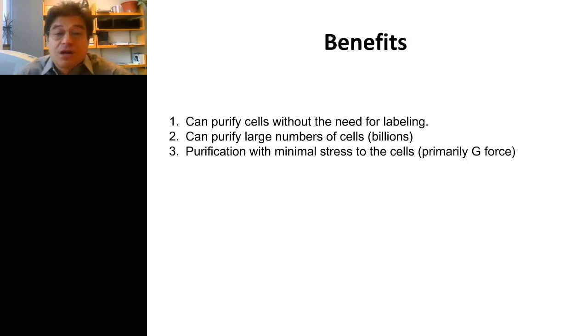The benefits there are a number of benefits in separation compared to other techniques. You can purify cells without the need for labeling. So this is kind of powerful in that you don't have to process the cells in any way before separating these cells. You can purify large numbers of cells, and it's been reported in some situations where you can process billions of cells.